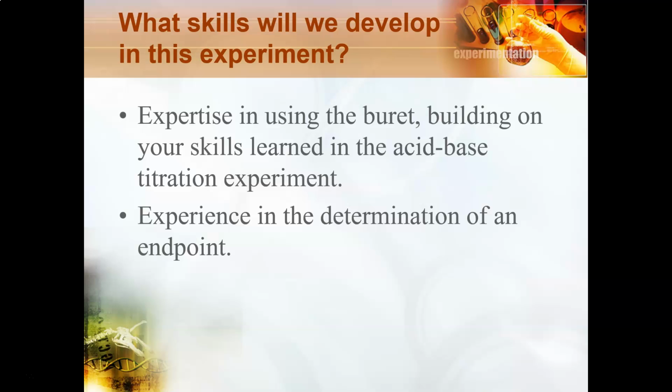So what skills will we develop in this experiment? Well, we will develop expertise in using the burette. You've used the burette before in the acid-base titration experiment, and we will also have experience in the determination of an endpoint. We are going to be using different indicators in this experiment than we did in the acid-base titration.